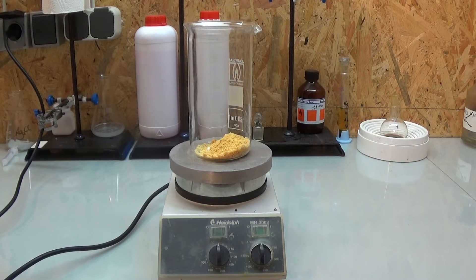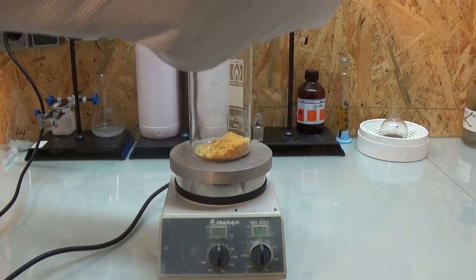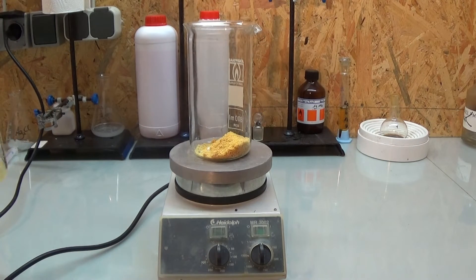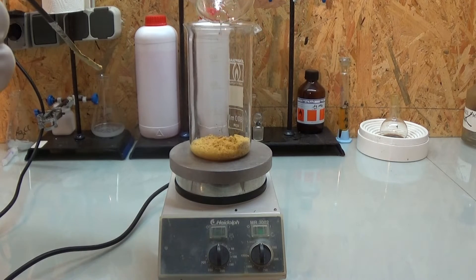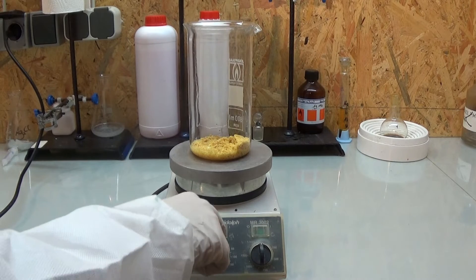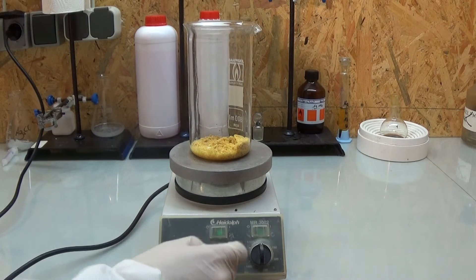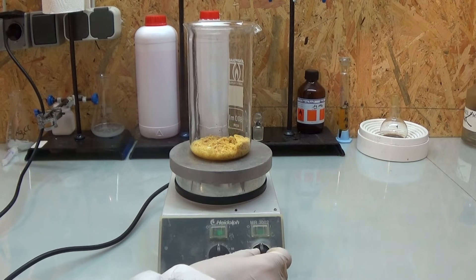After this we have to recrystallize to get rid of all the colored impurities. This can be done with the addition of some activated charcoal or just with water — do as you like. For the recrystallization, we add the crude cinnamic acid into a beaker and add distilled water. This is then heated just under 100 degrees centigrade and more water is added until all of the cinnamic acid has dissolved.